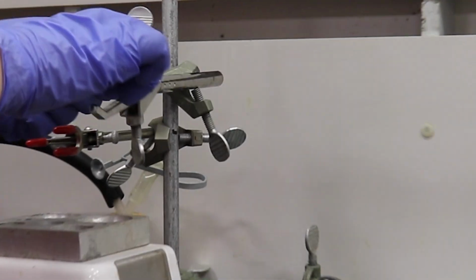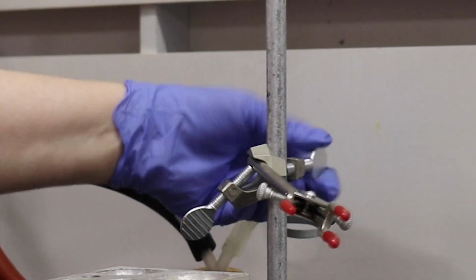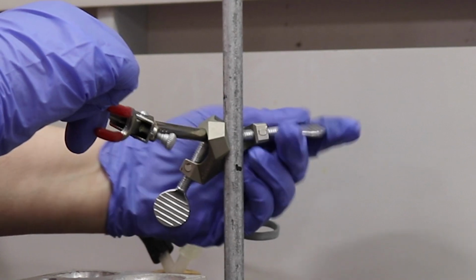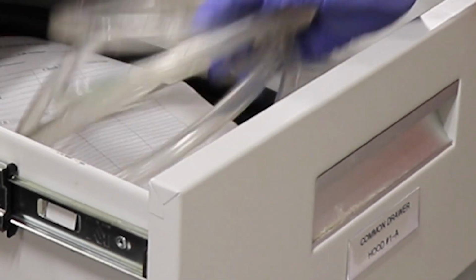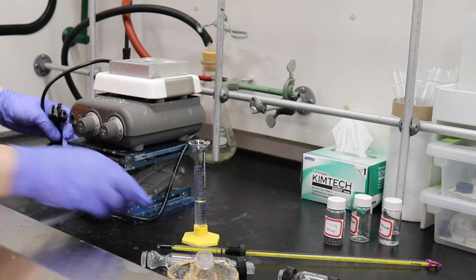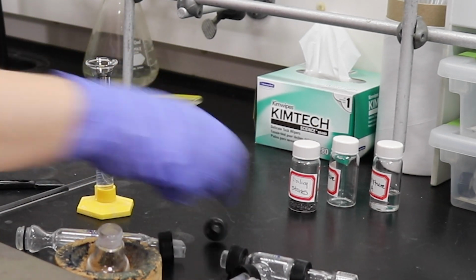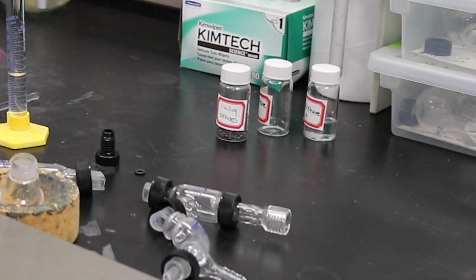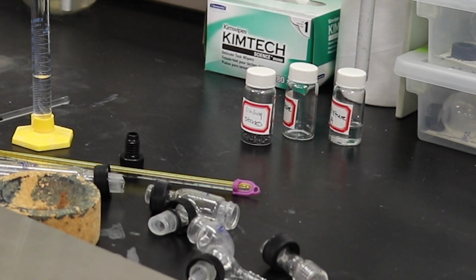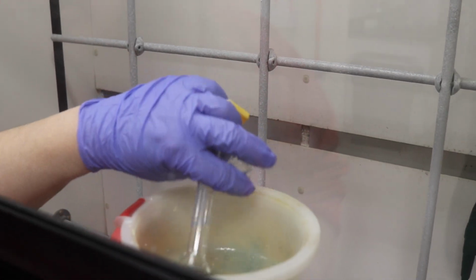We have to make sure that we leave our hood as we found it. So here you can see we're unclamping the clamp from the back of the hood, and then we take all our tubing and put it back in our common drawer along with our clamps. We put our jack down and wrap the cord around the jack, to make it as we found it. Take all the pieces off of our thermometer, the O-ring and the adapter, and make sure all our glassware is taken apart. Any extra liquid, our mixture, we just put into the waste jar in the hood, as you can see here.